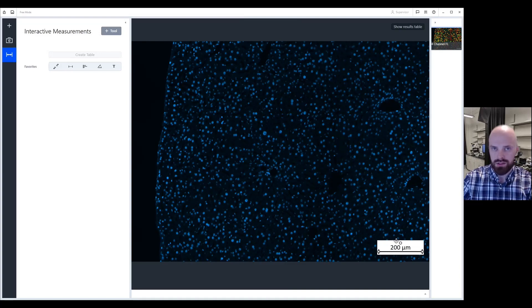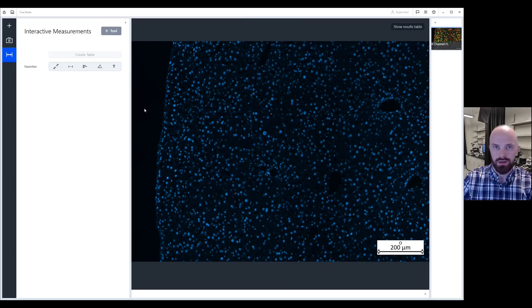And that concludes our session today on formatting the position and the style of our scale bar.